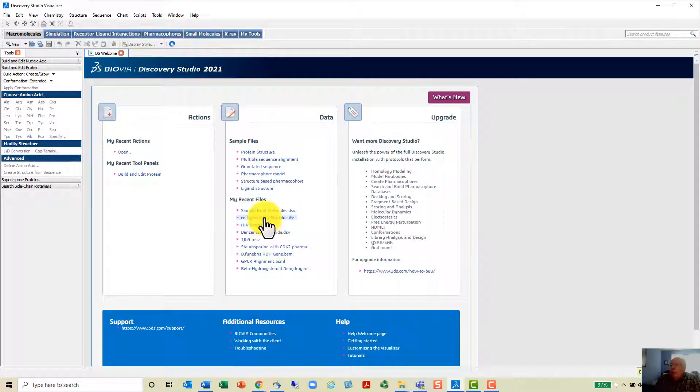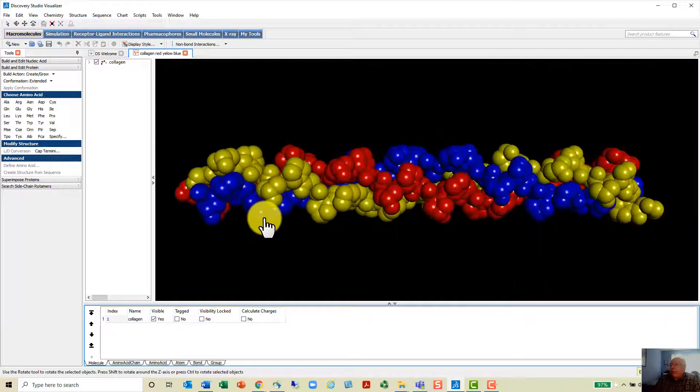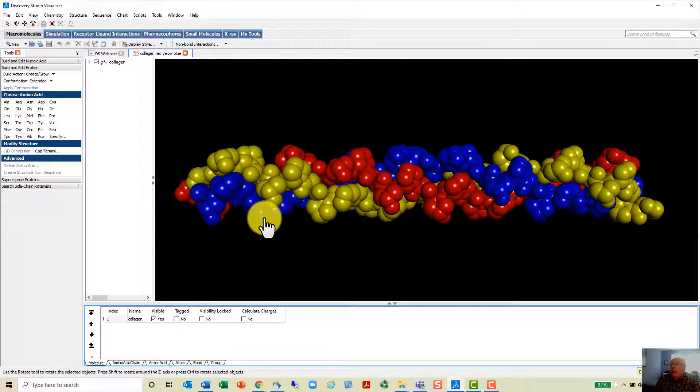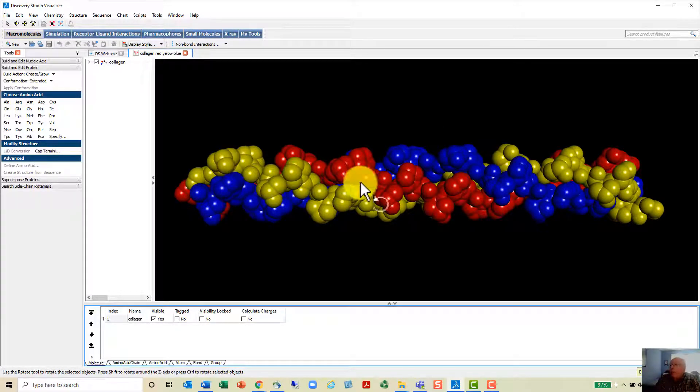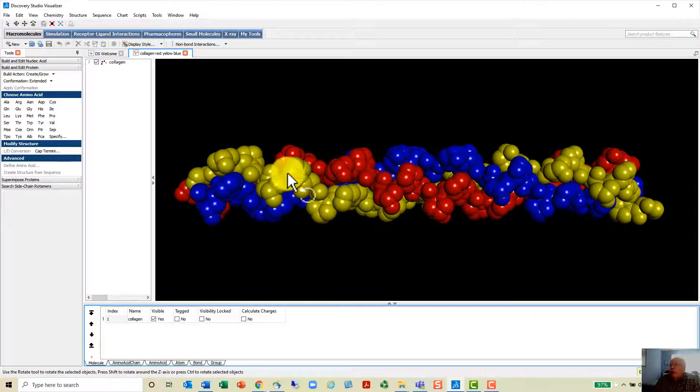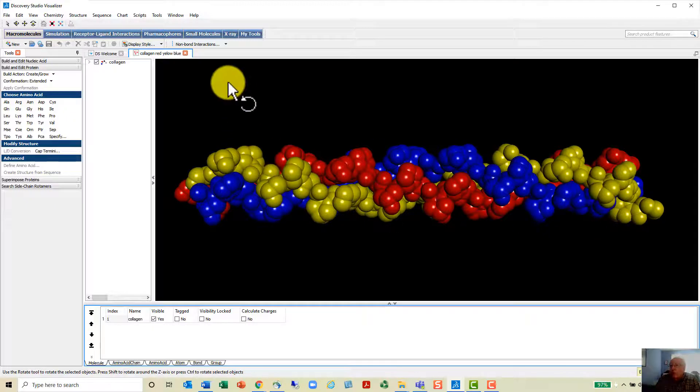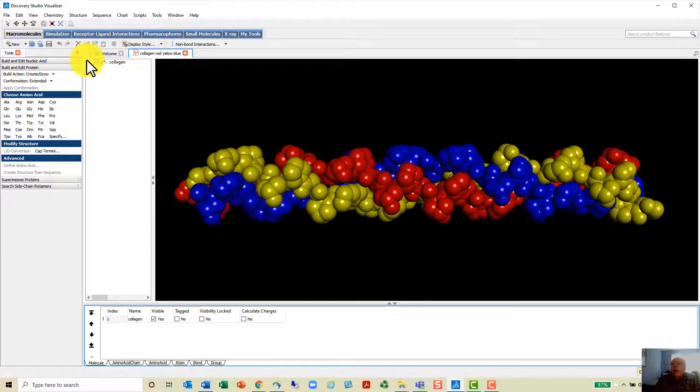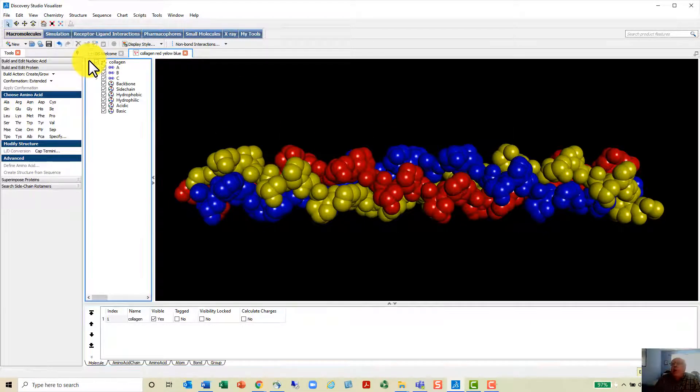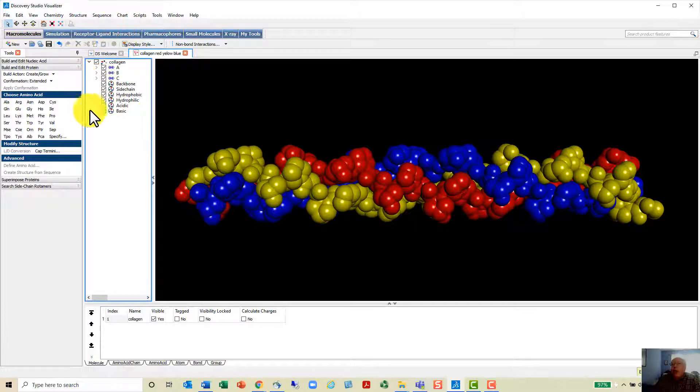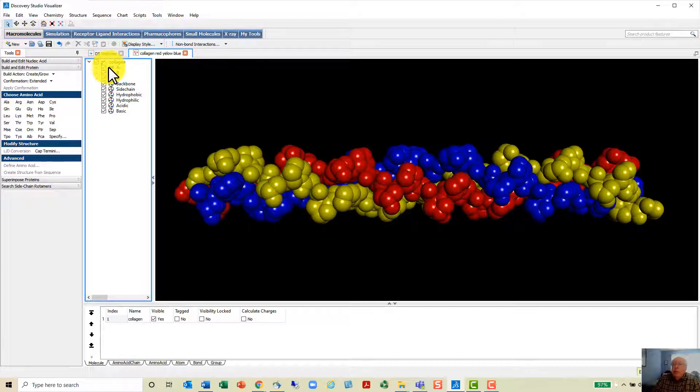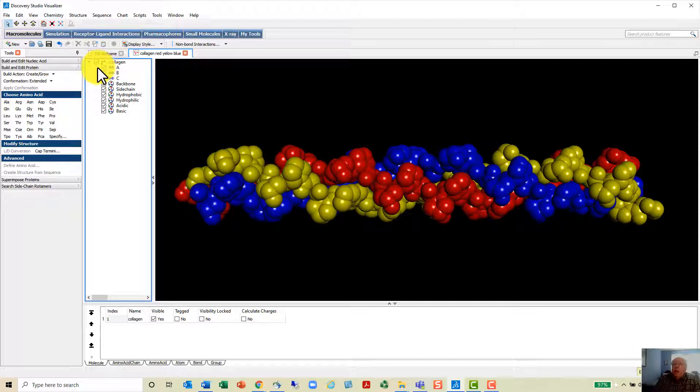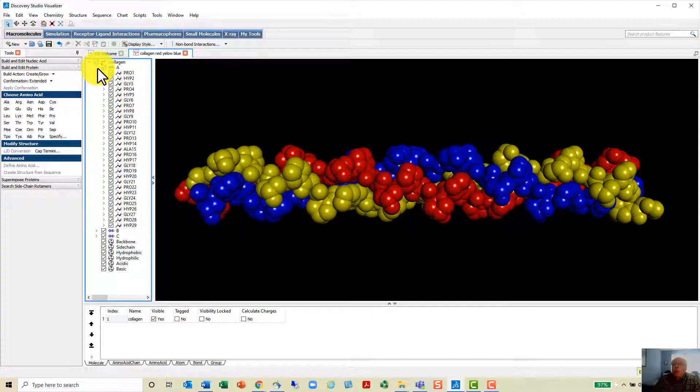Now I'm going to pull up a molecule that I have studied, and this is collagen. This is a space-filling model and you can see the three strands in different colors here. This is called the hierarchy window in this area and it lists out the chains. There are three chains: chains A, B, and C.